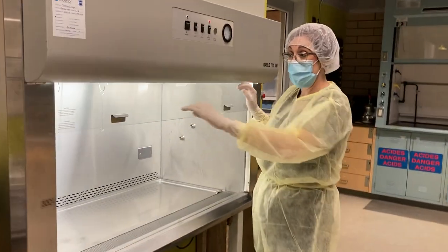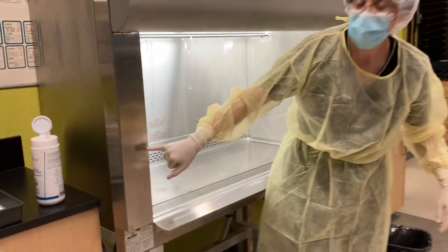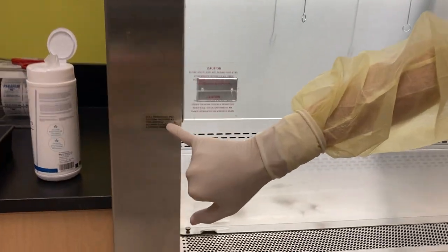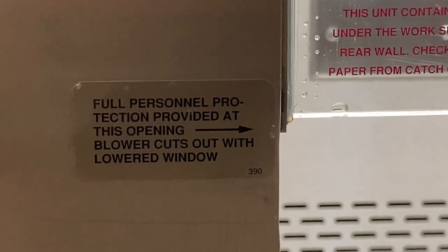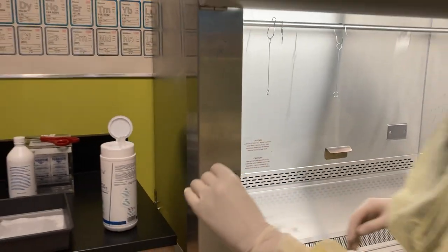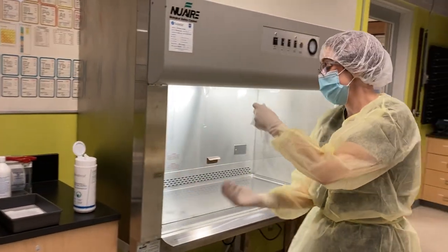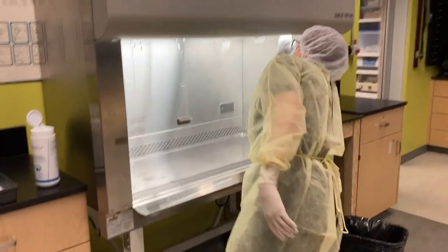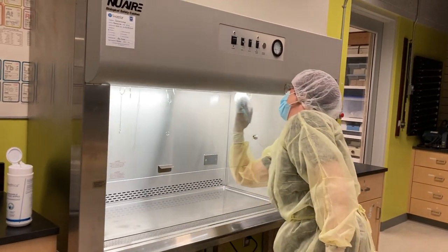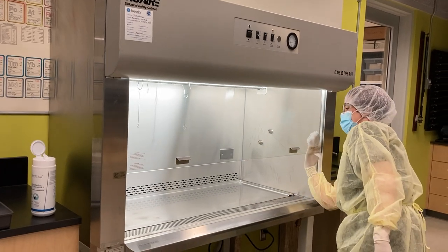Now, because this has a viewing window, we're going to lower it to the manufacturer's recommended height. So most hoods will have an arrow indicating where to set the viewing window. And so for this, we're going to use our germicidal agent using method A. Just reach as far as you can and going side to side, top to bottom.